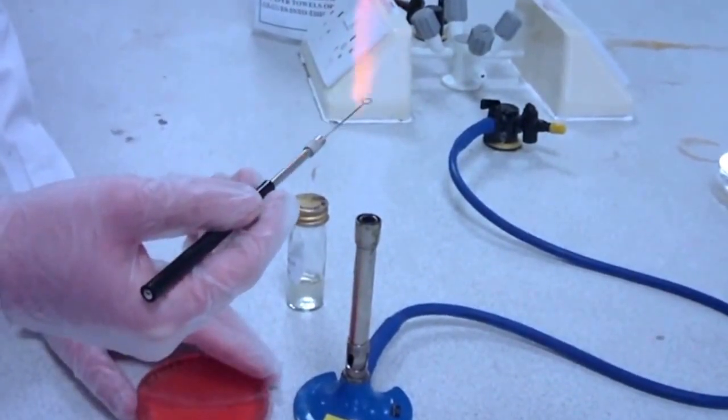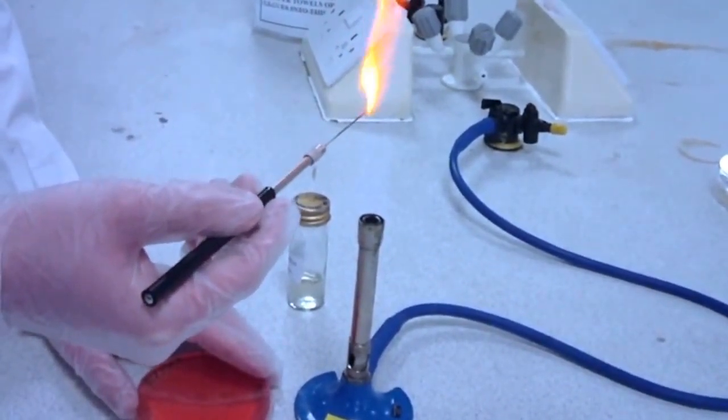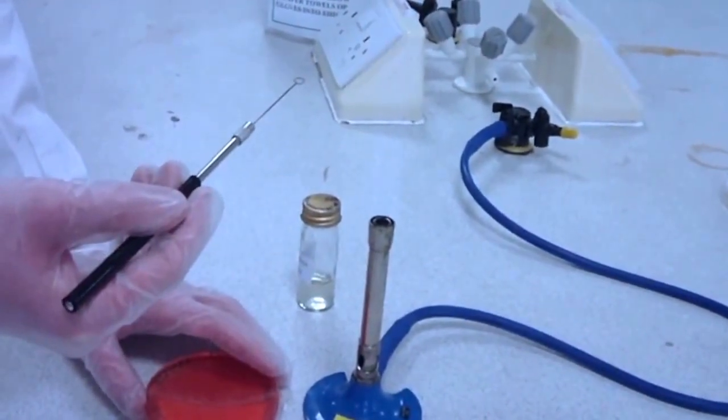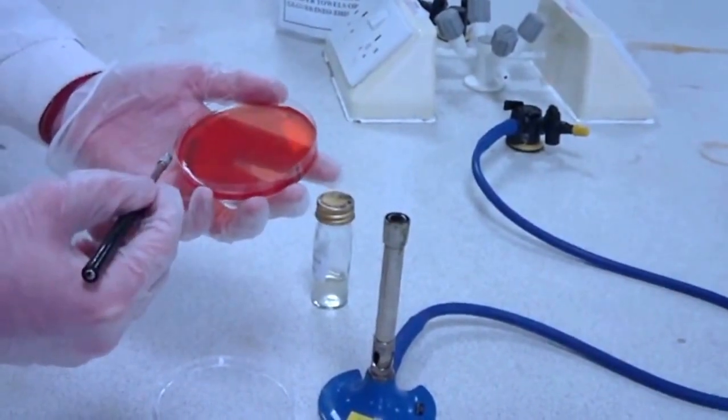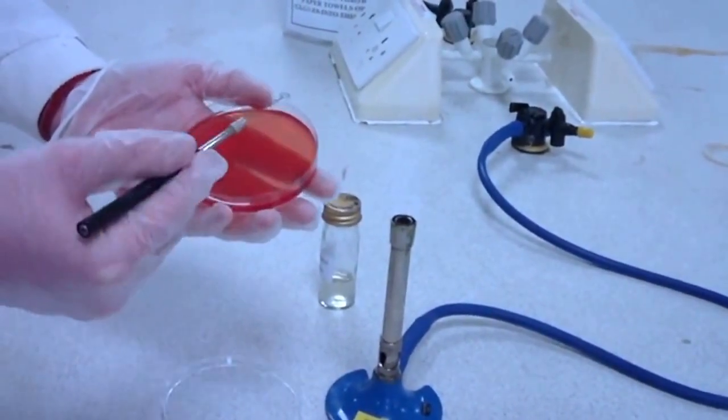Reflame the loop and allow to cool. And from the circle you've just rubbed on your agar, streak 3 to 4 lines in a clockwise manner to your next dot.